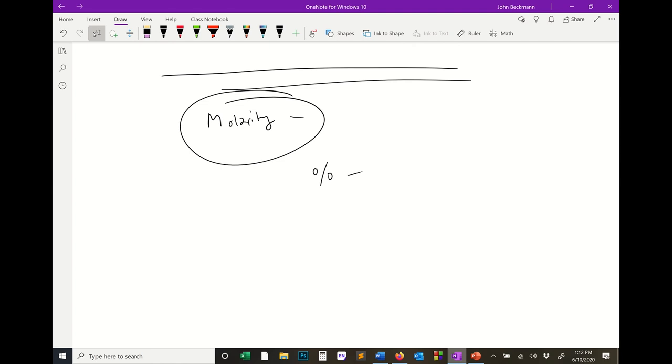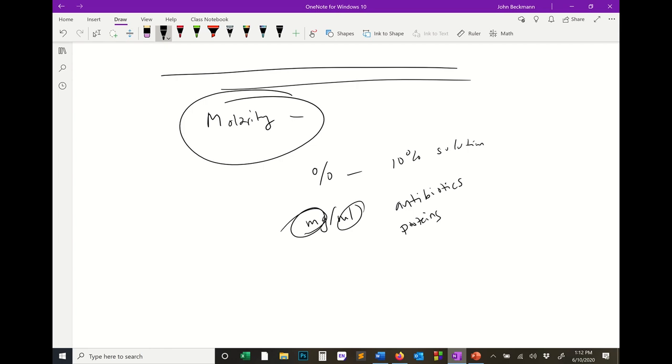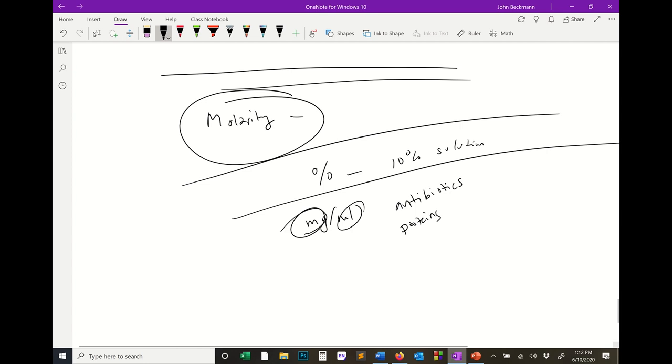We're not calculating the precise molarity of the sucrose. We're just saying it's a 10% solution of sucrose, okay? You'll see this very, very commonly. And like I said, migs per mil, this is very common for antibiotics and proteins. If you have a purified enzyme, it's often displayed as milligrams of that protein per mil. So essentially, the units that you use in a textbook chemistry class are not always the units that we're using in the wet lab. And you need to be familiar with these non-canonical units so that you don't get confused.